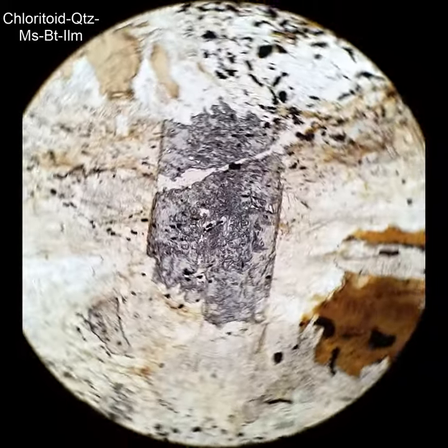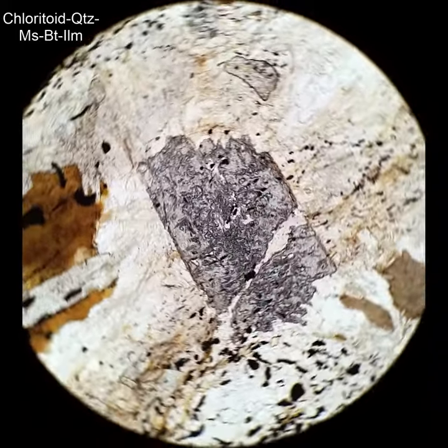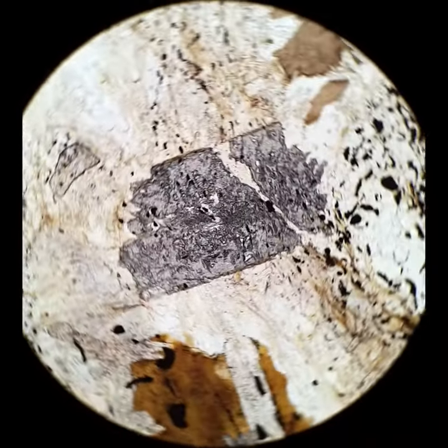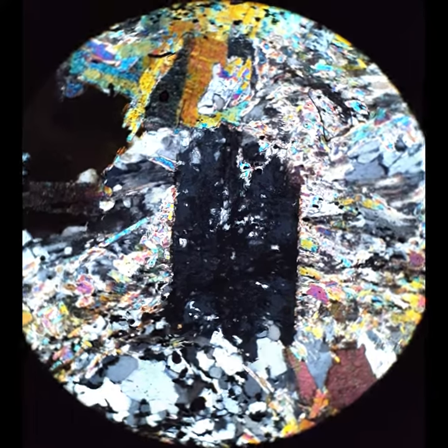This is really typical chloritoid in thin section: very high relief, blue pleochroic, and it's got normal pleochroism, so when it's running east-west, it's darkest. When I cross the polars, you'll see it has very low interference colors, and you can see some twins in there. The whole crystal does not go extinct all at once. Chloritoid commonly has a lot of inclusions in it, usually quartz inclusions.